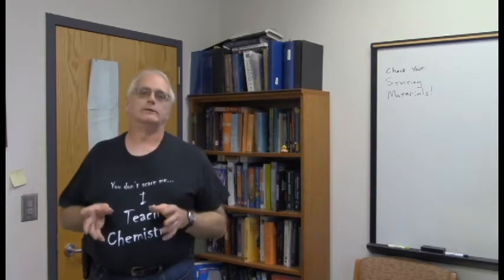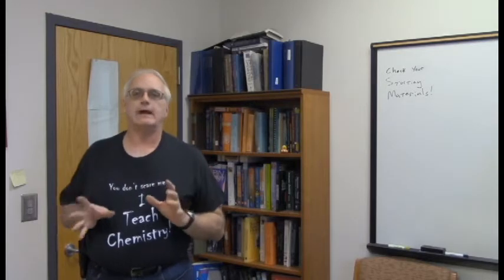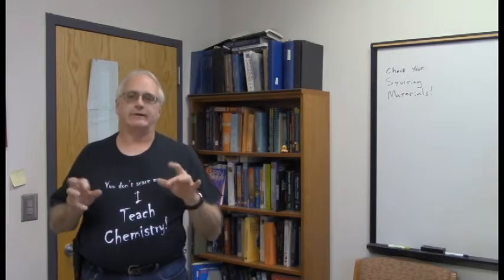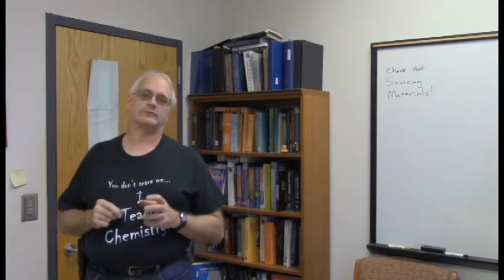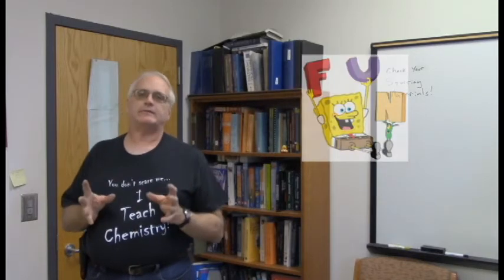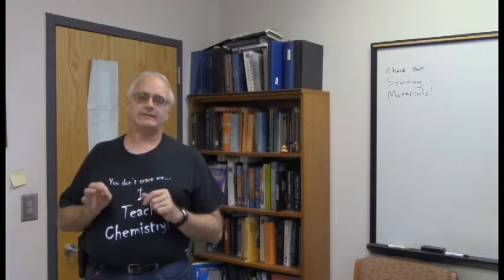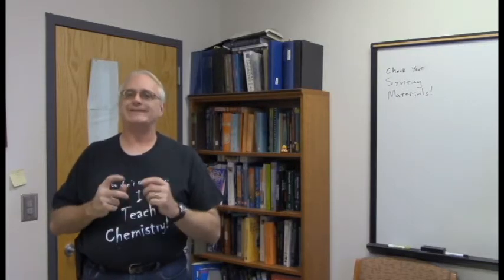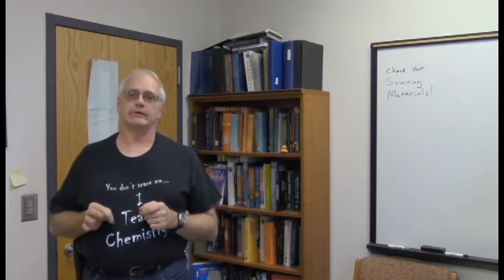NMR is most well known for its use in doing these big, elaborate structure determination problems. We have all these different spectra and you piece all the little parts together and finally come up with a viable structure. That is a hell of a lot of fun to do, but let's face it, NMR has many more uses than that. And in fact, some of the most common, most routine uses of NMR, I think, should be checking your starting materials.